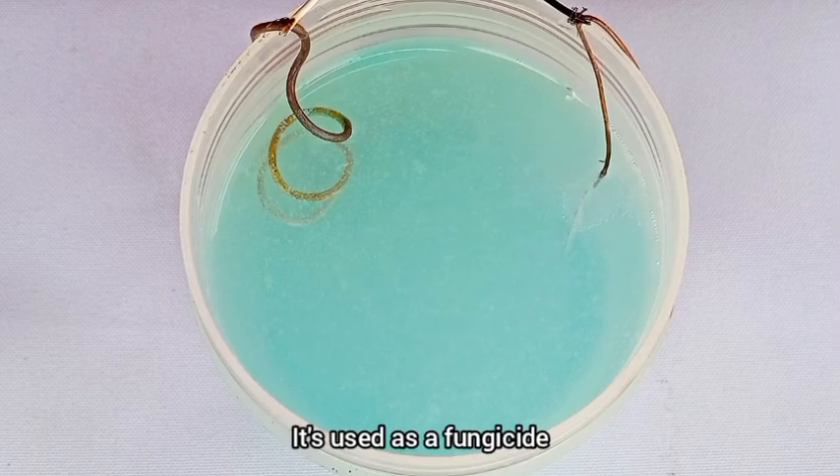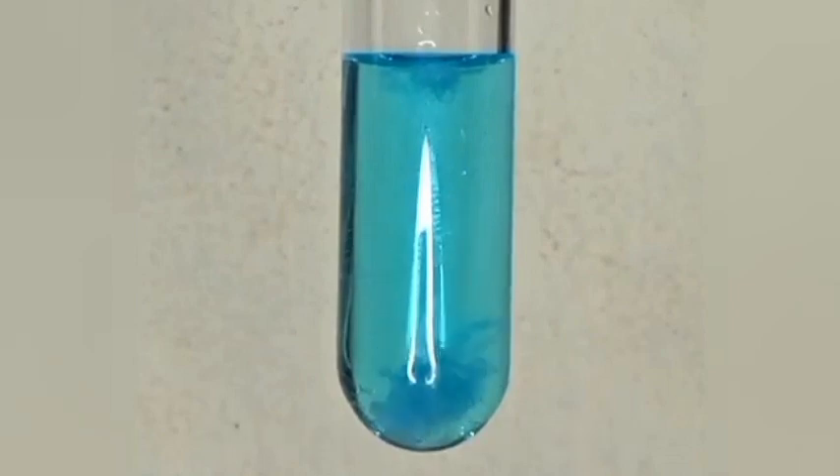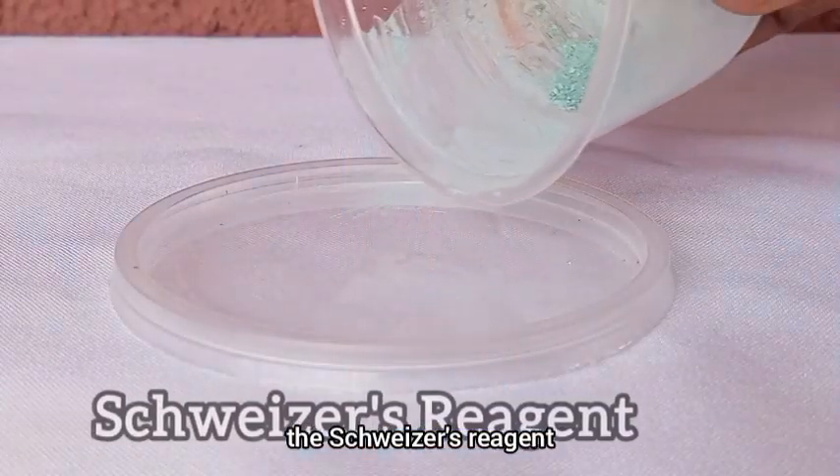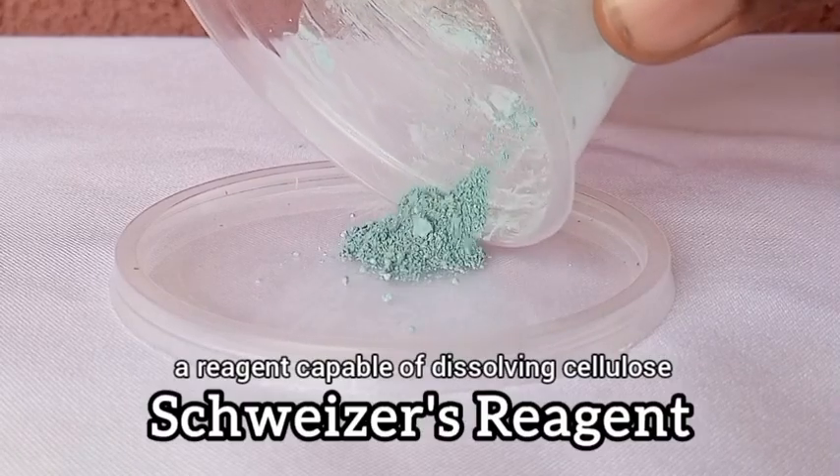It's used as a fungicide and it's a byproduct of many reactions, but it's also an essential material for preparing the Schweizer's reagent, a reagent capable of dissolving cellulose.